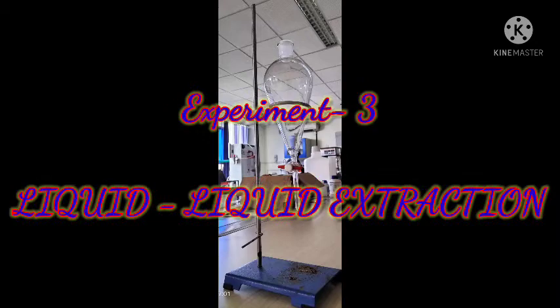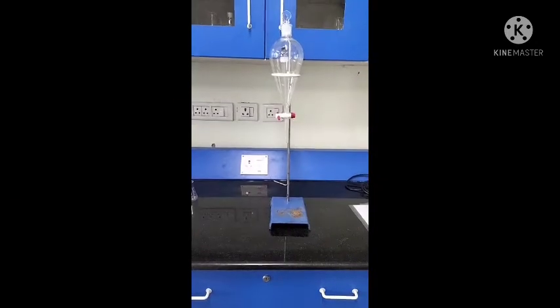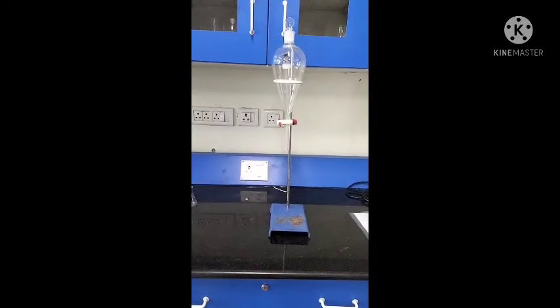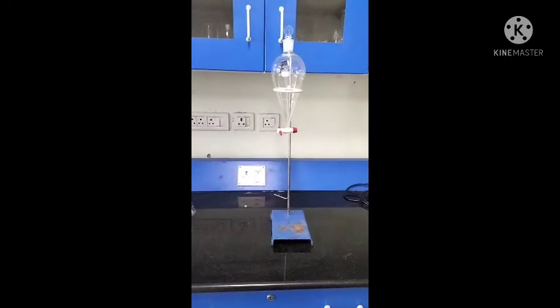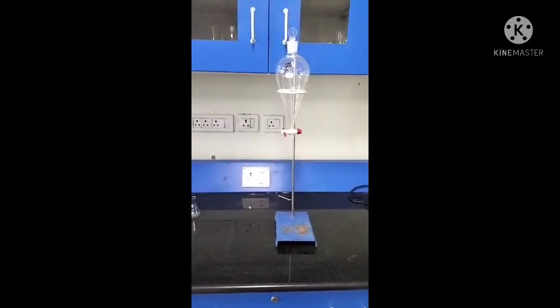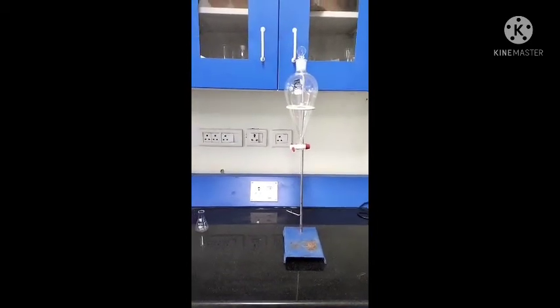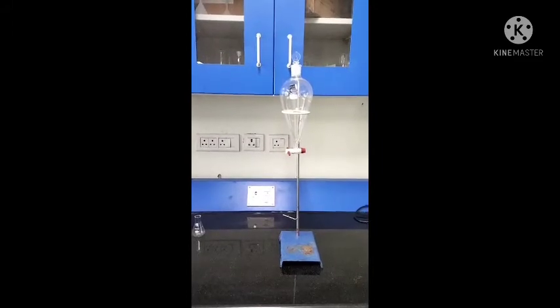This is an experimental setup of liquid-liquid extraction. The objective of this experiment is to study liquid-liquid extraction and determine the extraction characteristics of the solvent at various volumes of feed.